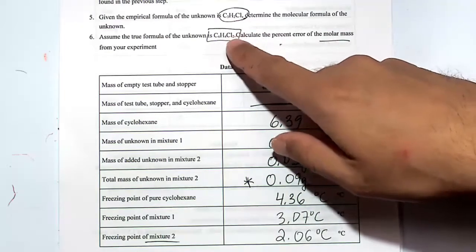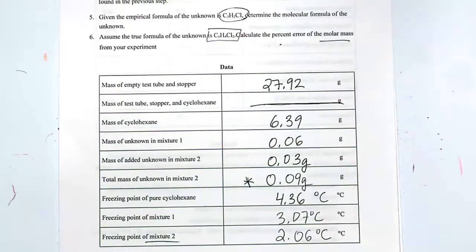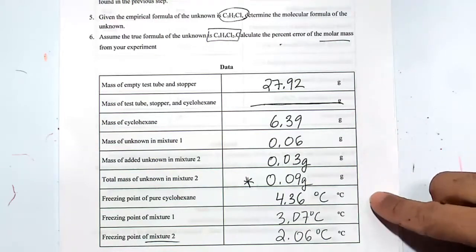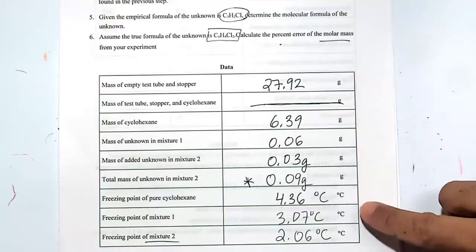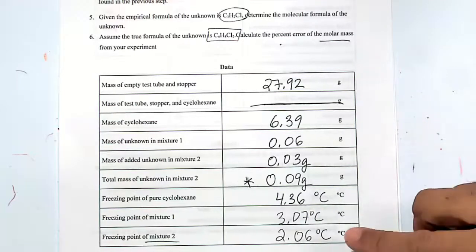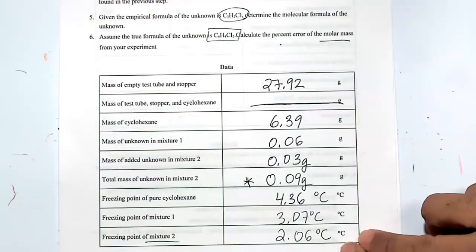How close can we get to our actual true molecular formula based on the data that we got? Just as a review, the pure cyclohexane melt freezing point was 4.36 degrees, from weighing about 6.39 grams. In mixture 1, which contained 0.06 grams of the unknown, the freezing point went down. Remember, freezing point depression. And when we added an additional 0.03 for a total of 0.09 grams, the freezing point went down from pure 4.36 degrees C to 2.06 degrees C.